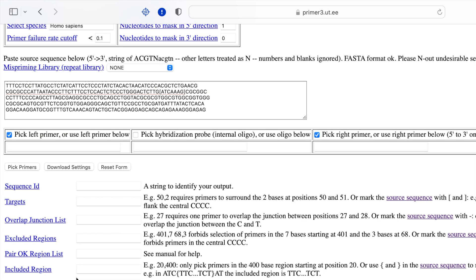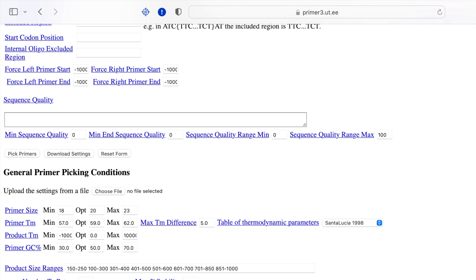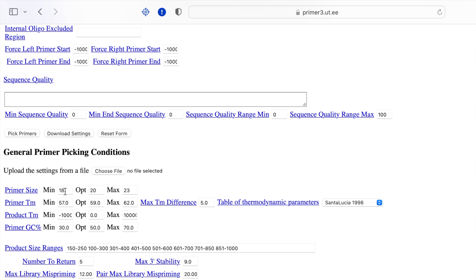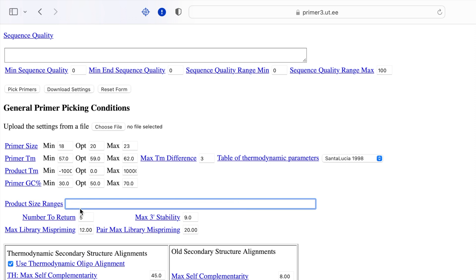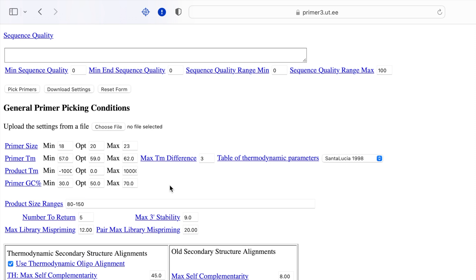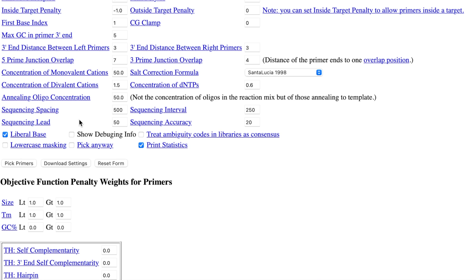These options can be left blank in their default state. In the general primer picking conditions, set the primer size and the primer melting temperature according to your choice. The maximum melting temperature difference can be adjusted if required. The table of thermodynamic parameters can be set to its default mode. The product melting temperature and primer GC percentage can also be set according to your choice. To design real-time PCR primers, the product size ranges can be lowered to a smaller size amplicon. The rest of the parameters can be left in default mode. Once the primer picking conditions are set, click Pick Primers.